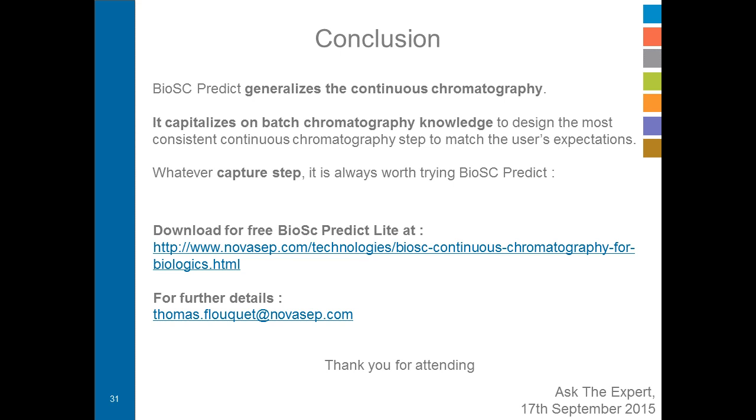Is the chromatography model based on mass transfer limited or kinetics limited? And what are the model assumptions? Well, during the modelization, the software defines the thermodynamics and the kinetics parameters of the solvent with your feed.